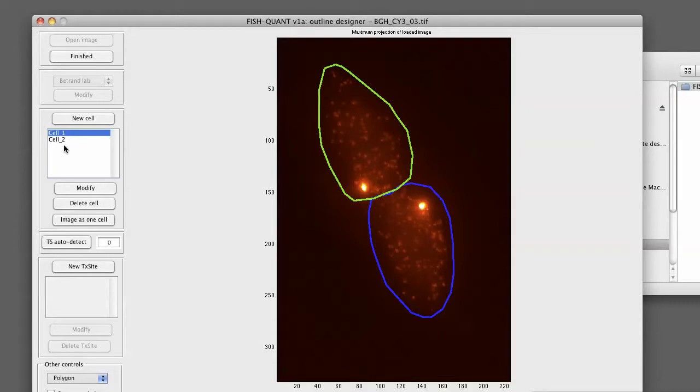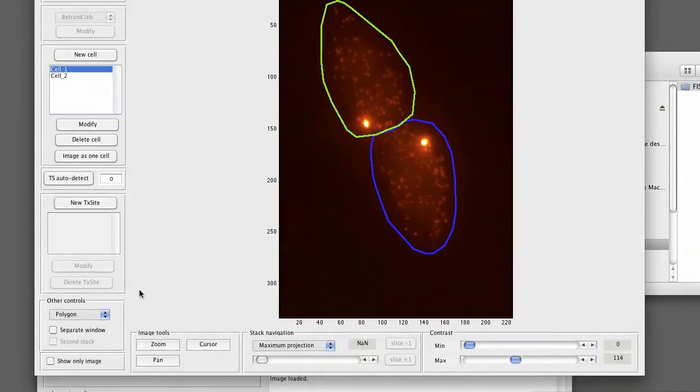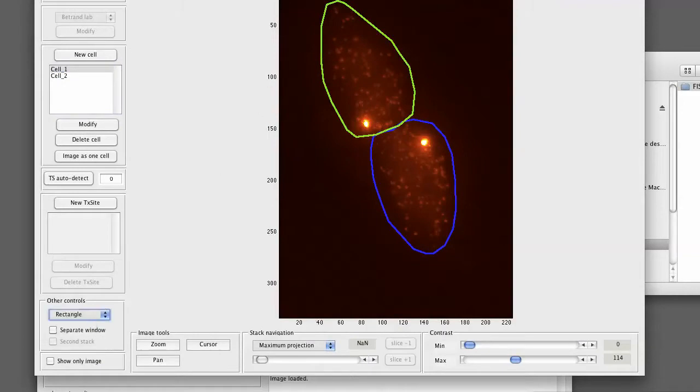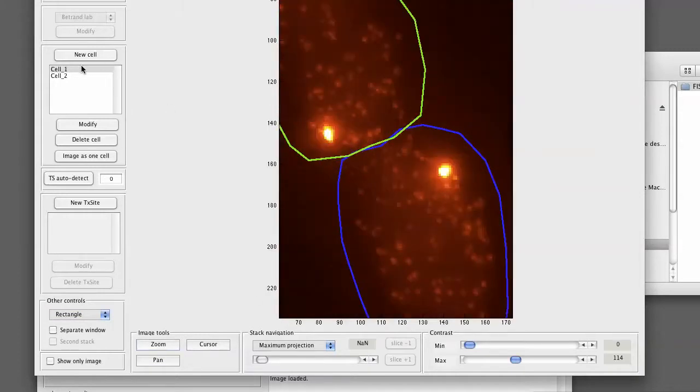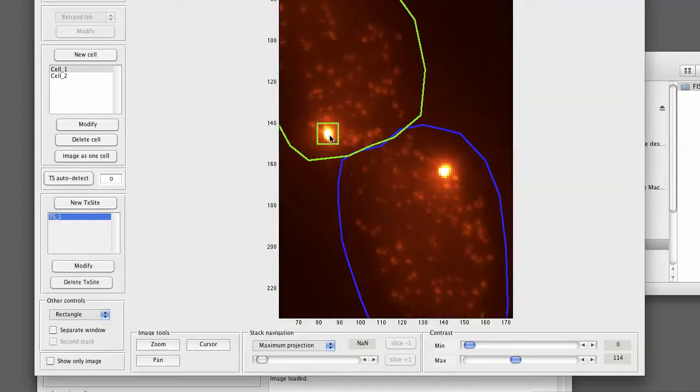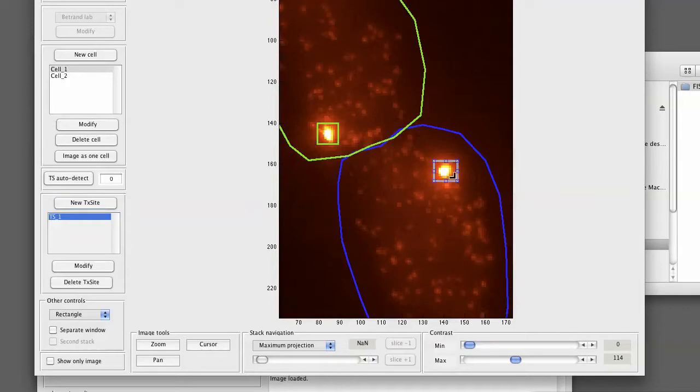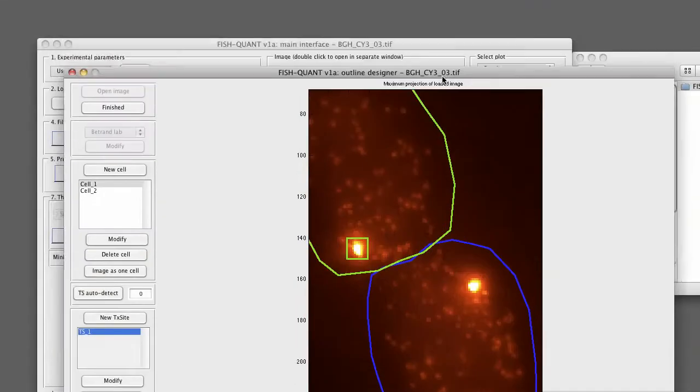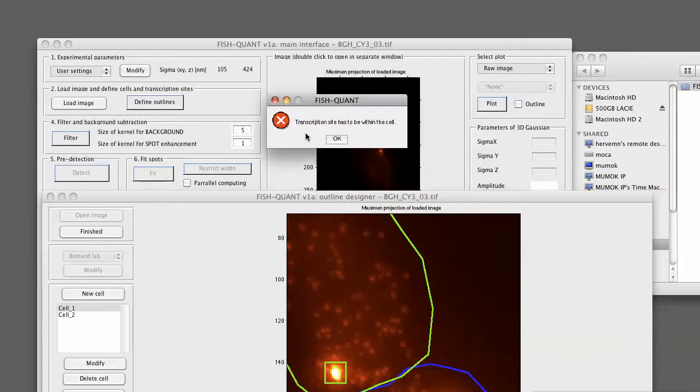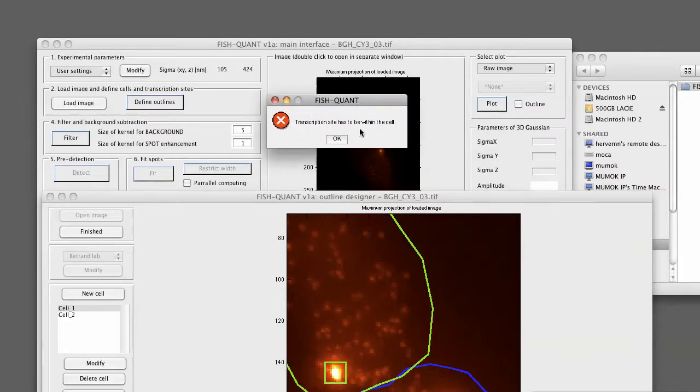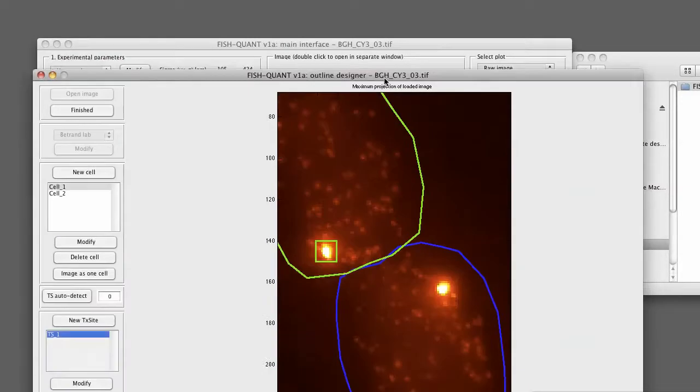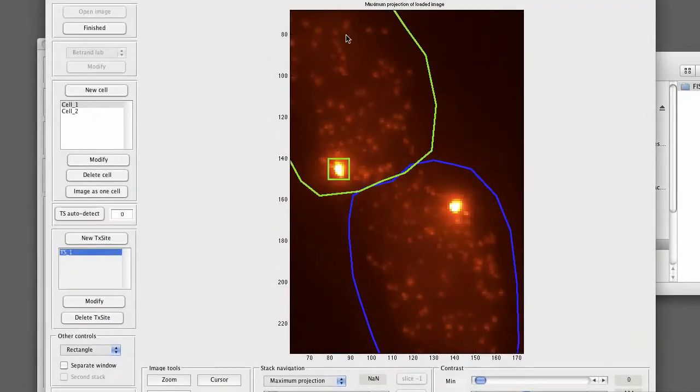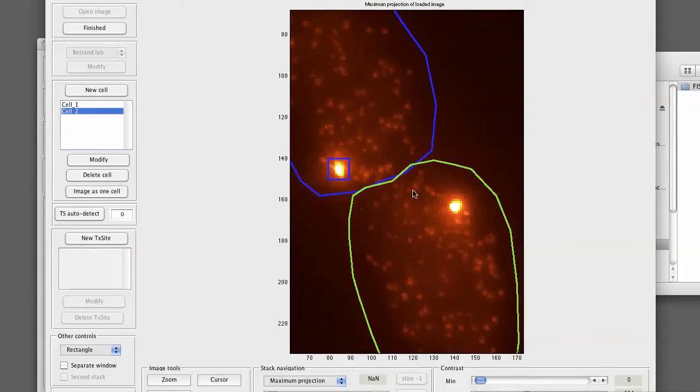So we now want to select cell 1 to define the first transcription site. As a geometry, we can use the rectangle. We can also zoom into the image to make it easier. We click on new transcription site. We simply draw a rectangle around the site. If we now want to highlight the second transcription site, we forget to switch to this cell. FishQuant will simply tell us that it's not possible and it will not draw this outline. You're going to get the error message that says transcription site has to be within the cell. So simply select the second cell and draw your transcription site.